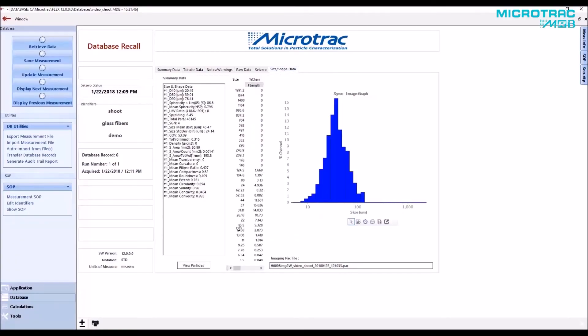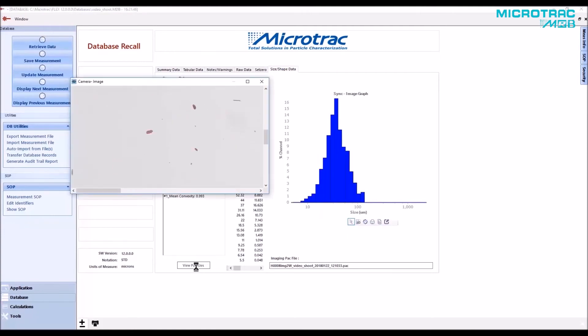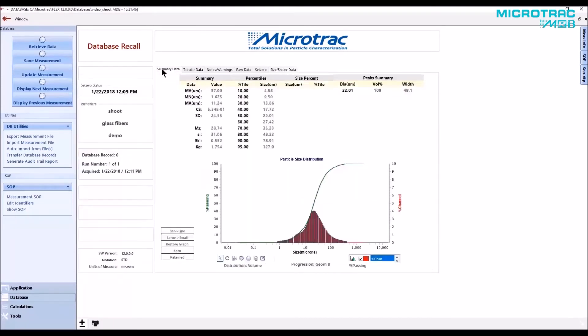Microtrack's Flex software collects data from the detector arrays and camera and applies our proprietary algorithms to generate particle size distributions and more than 30 shape parameters, all through an easy-to-use integrated graphical user interface.